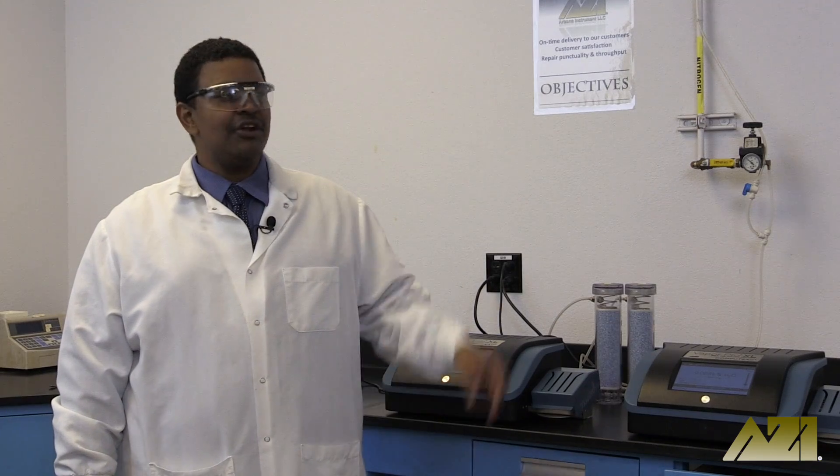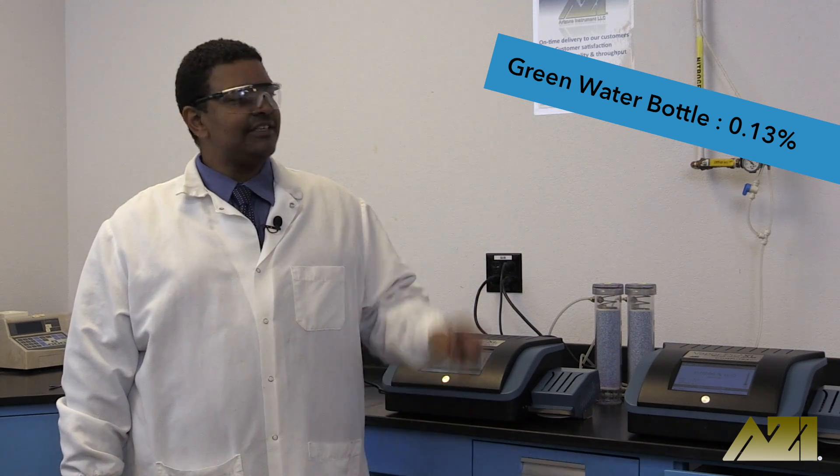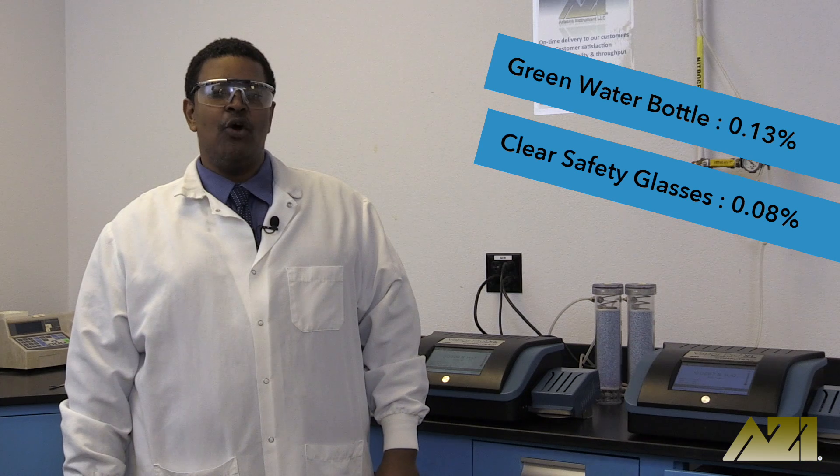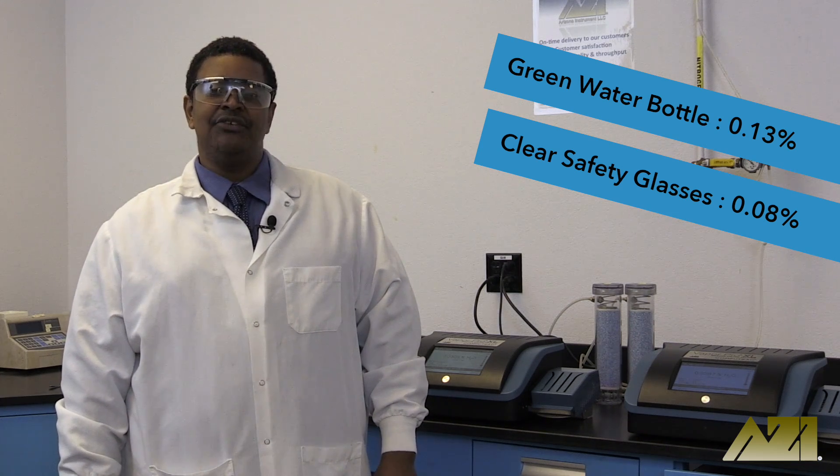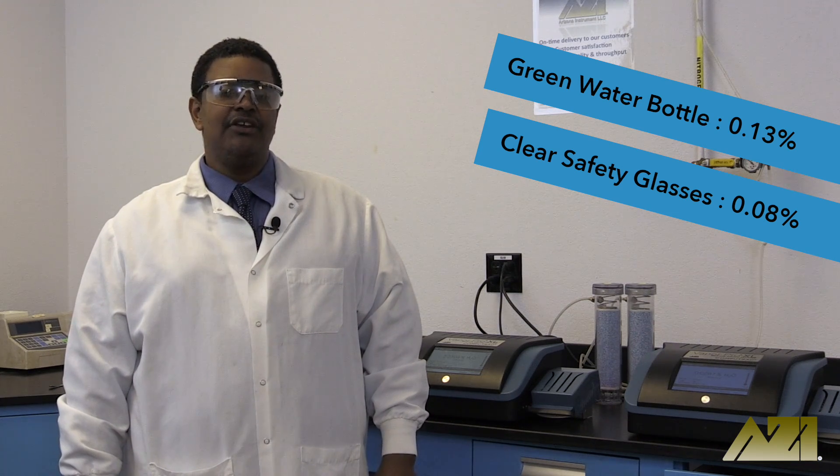At 0.13% moisture, the green water bottle has about 60% more moisture than the clear safety glasses, which came in at approximately 0.08%. This is most likely due to the addition of a green colorant to the water bottle.